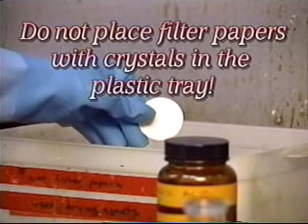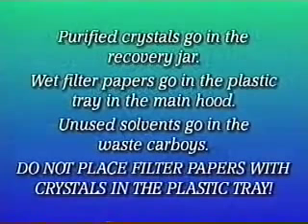When the solvent has evaporated, these filter papers are thrown in the trash. To assure proper treatment and disposal of organic compounds, and thus the safety of our environment, they must be placed in the jars and containers as directed in your lab manual.